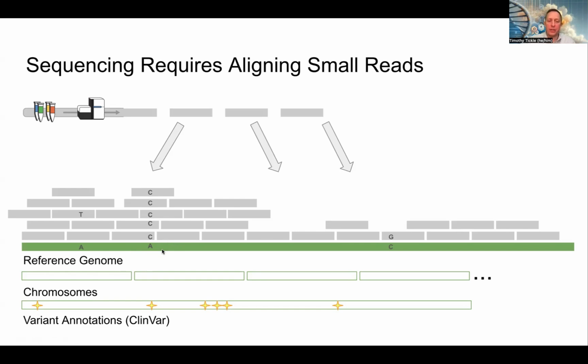You can also use annotations to better understand the context of that mutation as well. For instance, here we have the sections of the reference genome sectioned off as different chromosomes. So we can tell, for instance, that this mutation's in the second chromosome. And as well, things like ClinVar, for instance, are databases of locations on the genome where mutations can occur, and if so, if they are potentially pathogenic, for instance. And so in this case here, this mutation's on this chromosome and is potentially pathogenic. And so that's a kind of analysis and processing and query that I will do on AWS Healthomics and Athena.